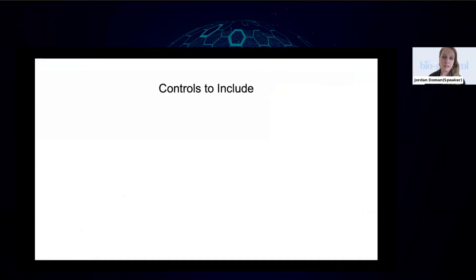So at this point, we've gone through the whole prime editing workflow. I just want to touch on some controls, both positive and negative, that are going to be really important and really informative to include. The first one, by far the most important, is an untreated control, which sounds obvious, but if you're working with a very small number of cells to start with, it's very easy to get contamination from the environment or from you.